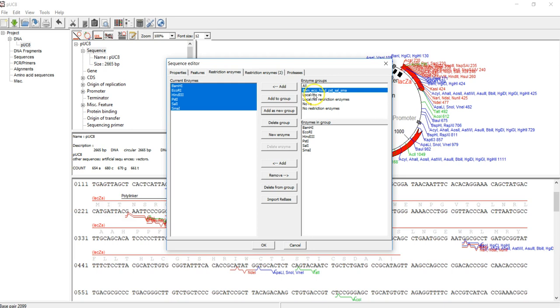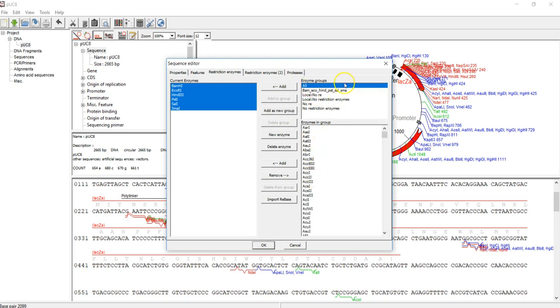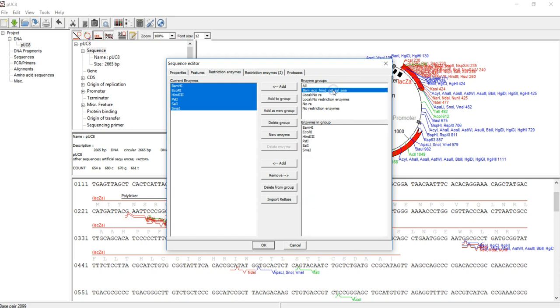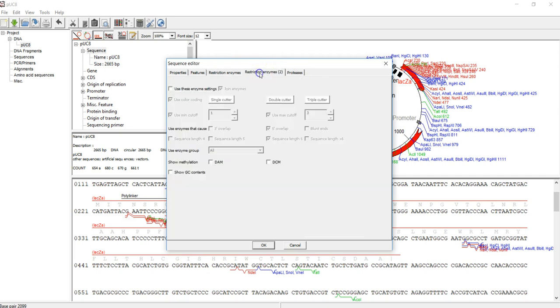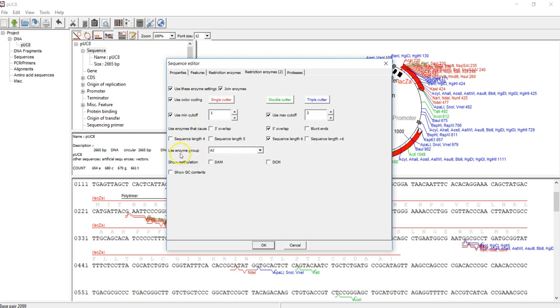You click 'All' and everything will show up. You click only this newly created one and only that is available. After you save this, then you click the second Restriction Enzyme tab. Then you choose 'Use enzyme setting'—check this box. Then it will allow you to choose different enzyme groups.